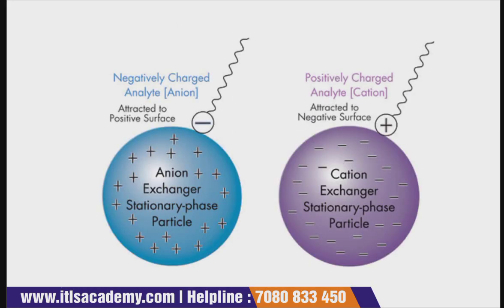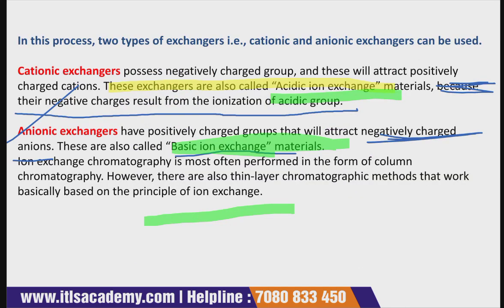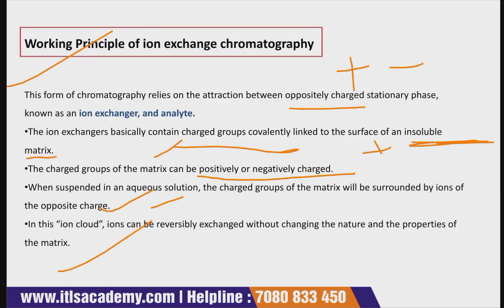Then they can ask you to differentiate between a cation exchanger and an anion exchanger. So you must be aware of a cationic exchanger and anionic exchanger. Then the working principle of ion exchange chromatography is a must question. Every time in examinations you get this question.